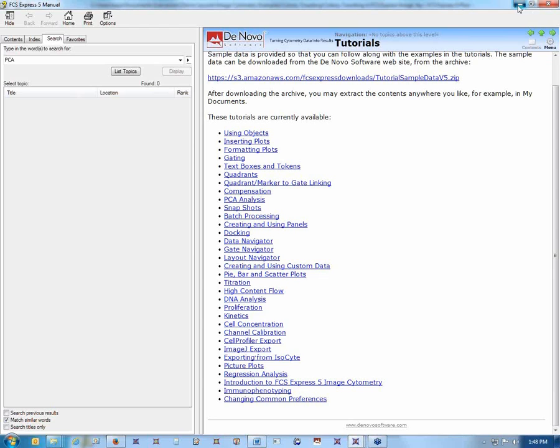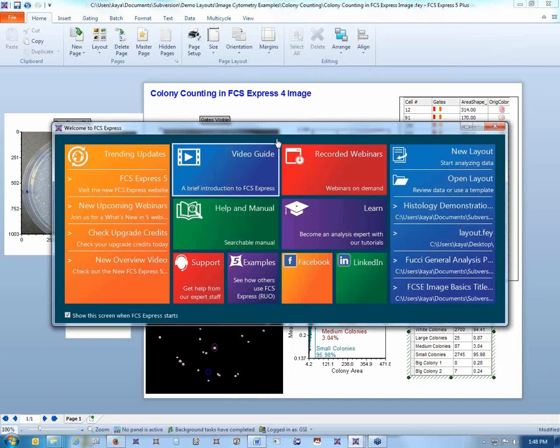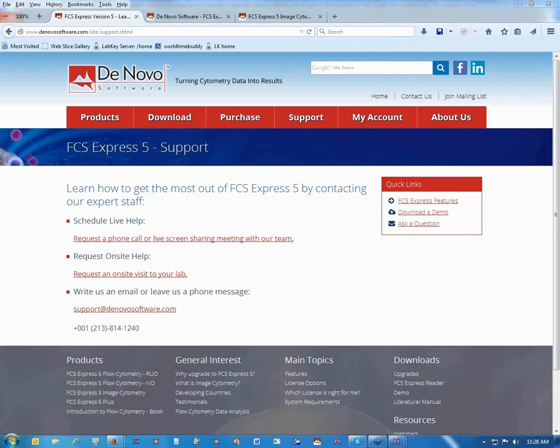Okay? And also for getting help, if you download the FCS Express 5 demo, which I'll show you how to do, and you run it on your machine, when you first start it up, you'll be faced with this startup screen. So if you need any help at all, you can just click on the Support tab here. That will take you to this web page where you can click on the first link to request a phone call or a live screen share session with our team. We can help you out over the internet with your own layout, looking through your own data or our sample data, and help you learn more about the software features that might be useful to you.